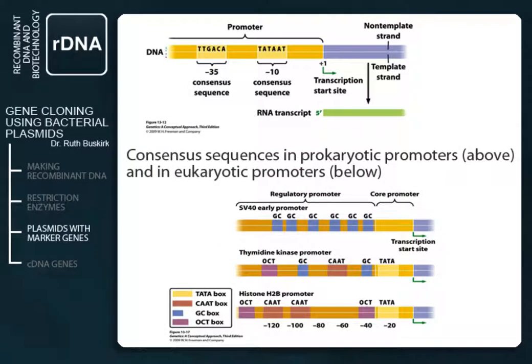In this example of gene cloning, we are asking a prokaryotic cell to express a eukaryotic gene. You already know some of the differences between prokaryotic and eukaryotic genomes and gene expression, so consider how this lab process of gene cloning must be tailored to bacteria. For example, when inserting the human growth hormone gene, can we use the human promoter? No, bacterial RNA polymerases will only recognize a prokaryotic promoter.